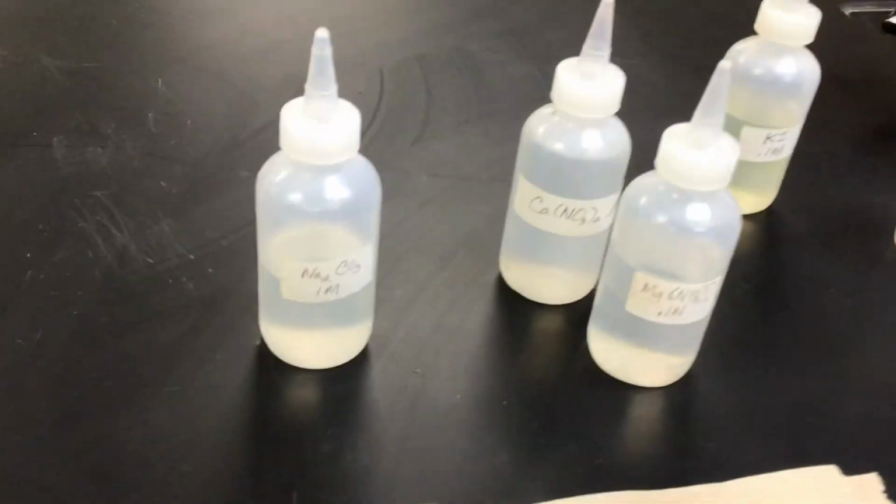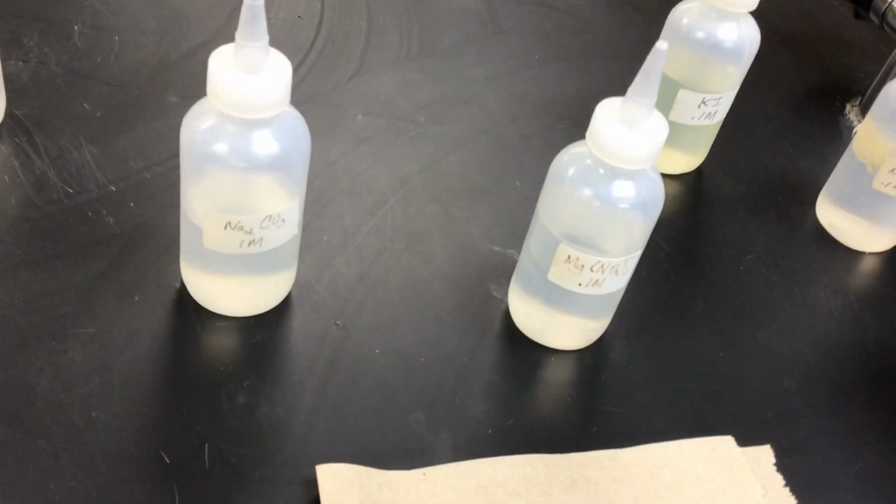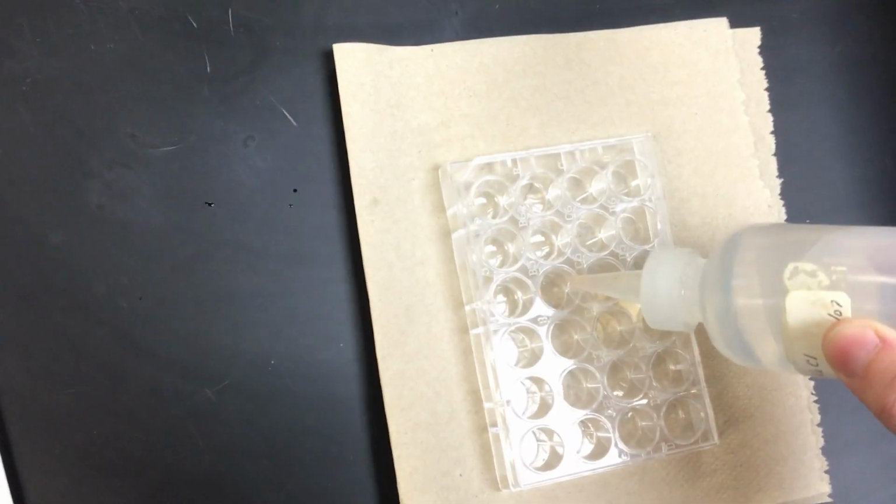Our next one is the calcium solution, Ca(NO3)2. And the bottle that has Ca(NO3)2 is this one. The next one is the chlorine solution, and that is going to be NaCl. So here's our NaCl. Sorry if I'm not getting myself in the screen. It's really hard to do this.